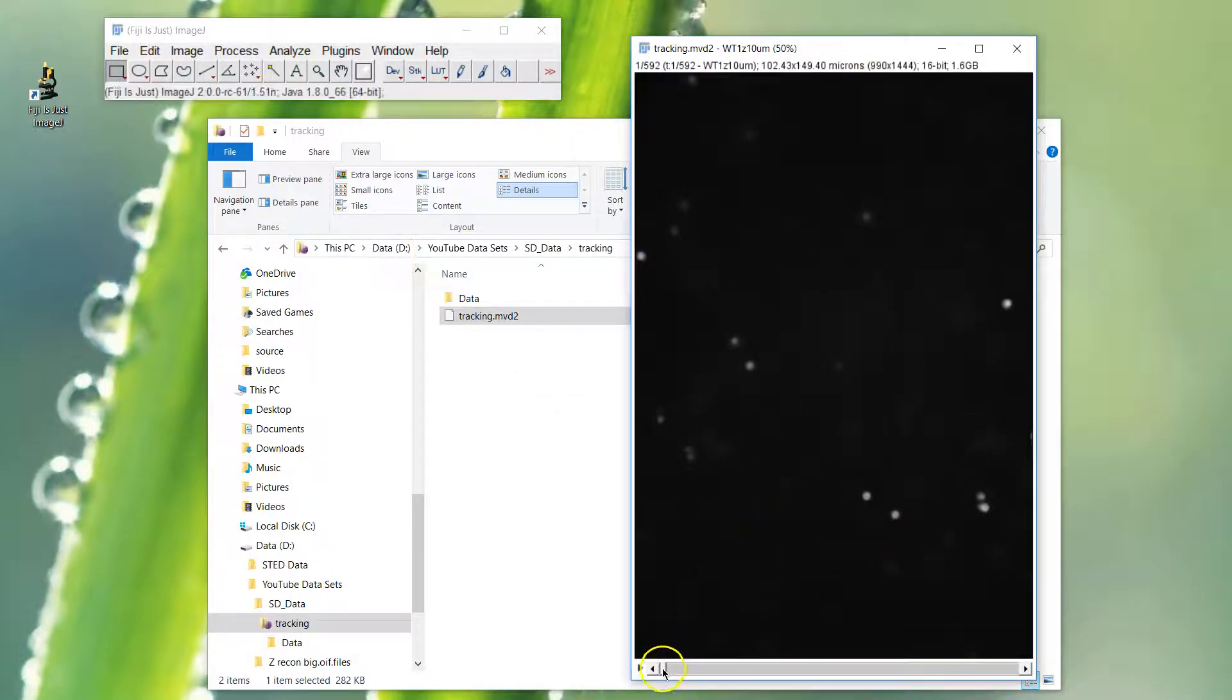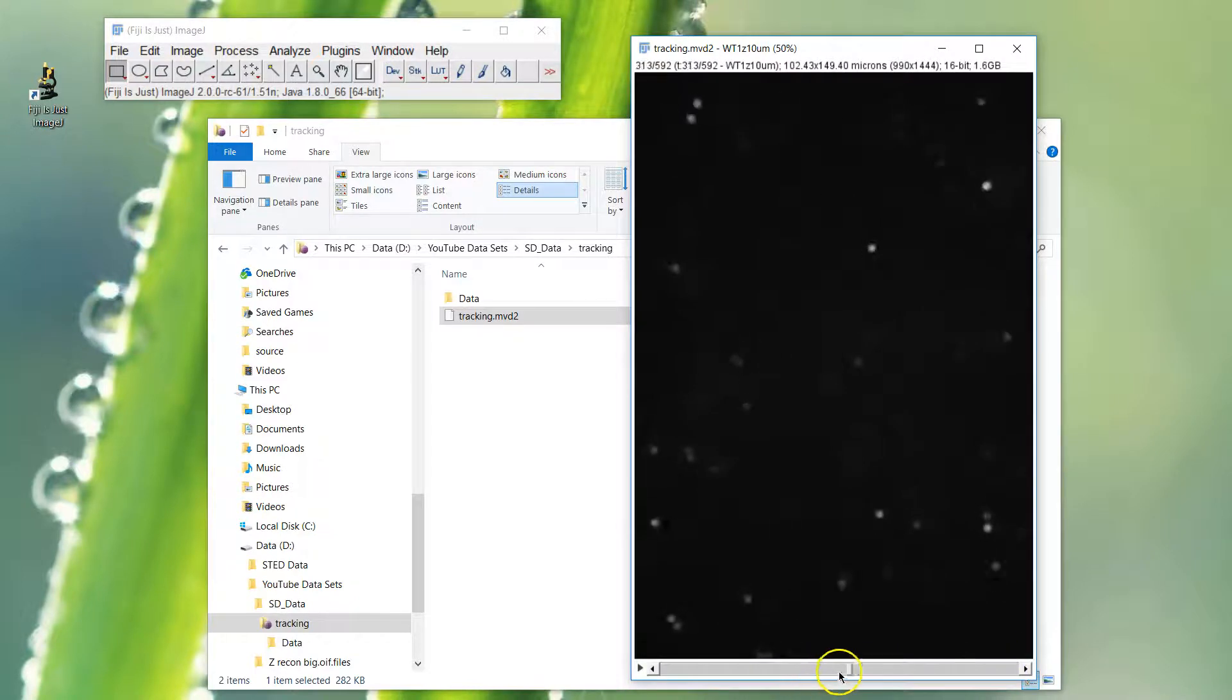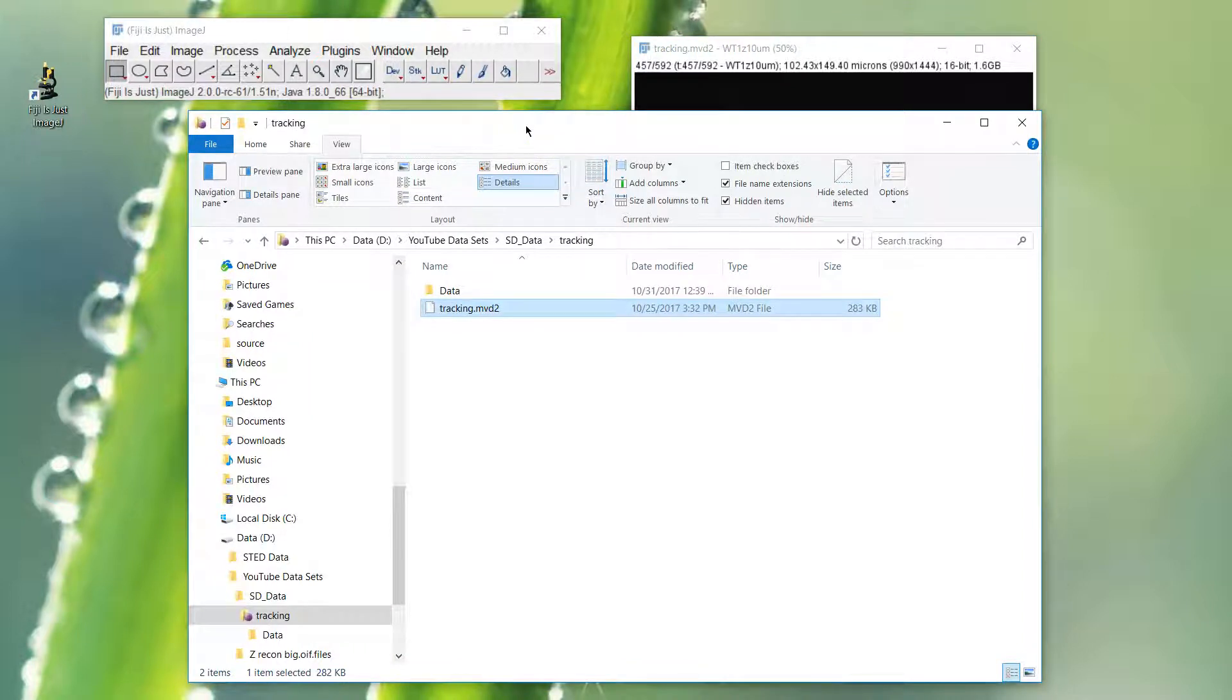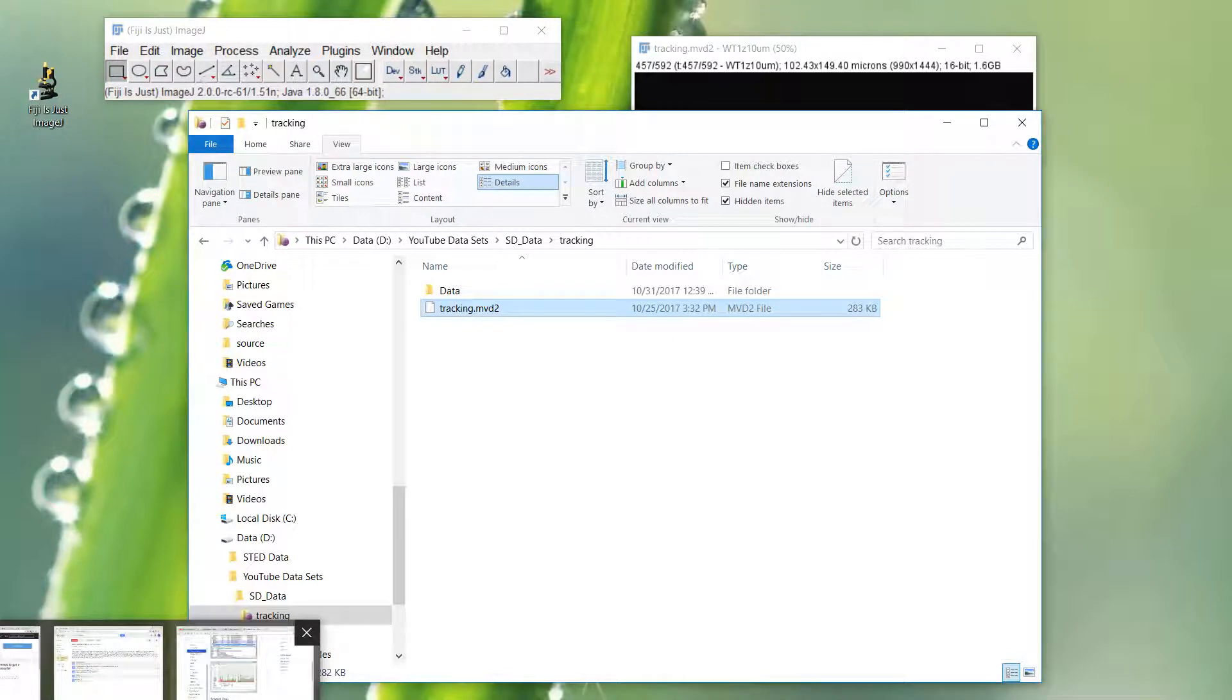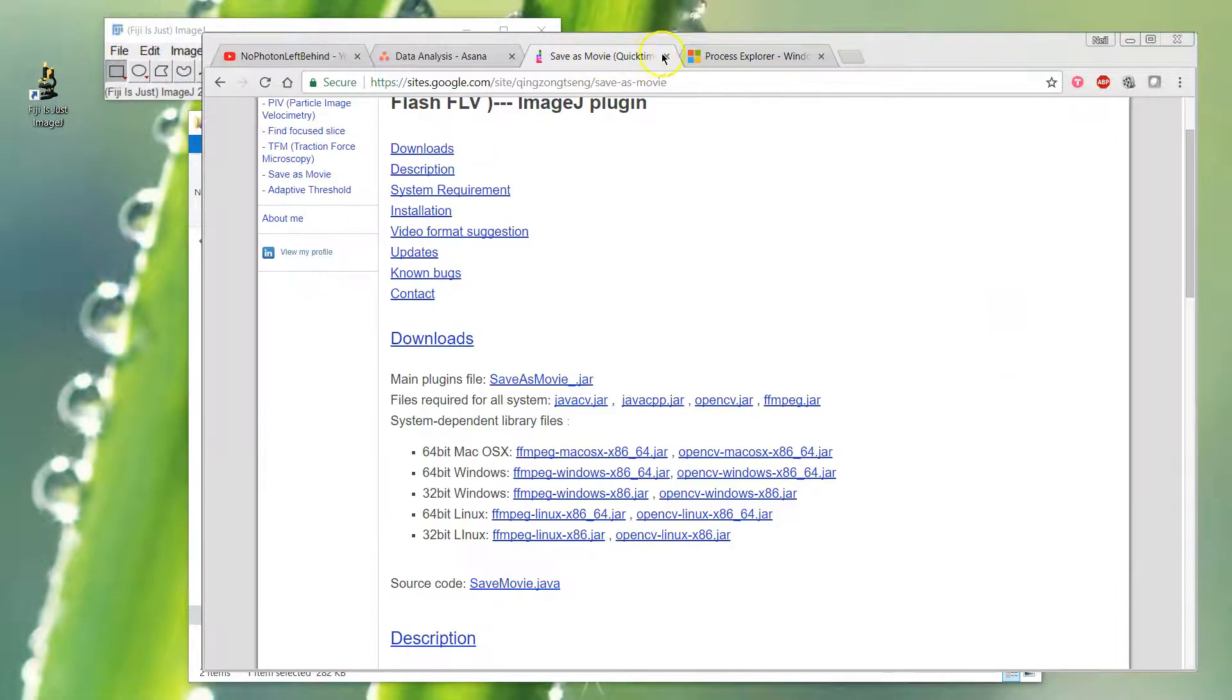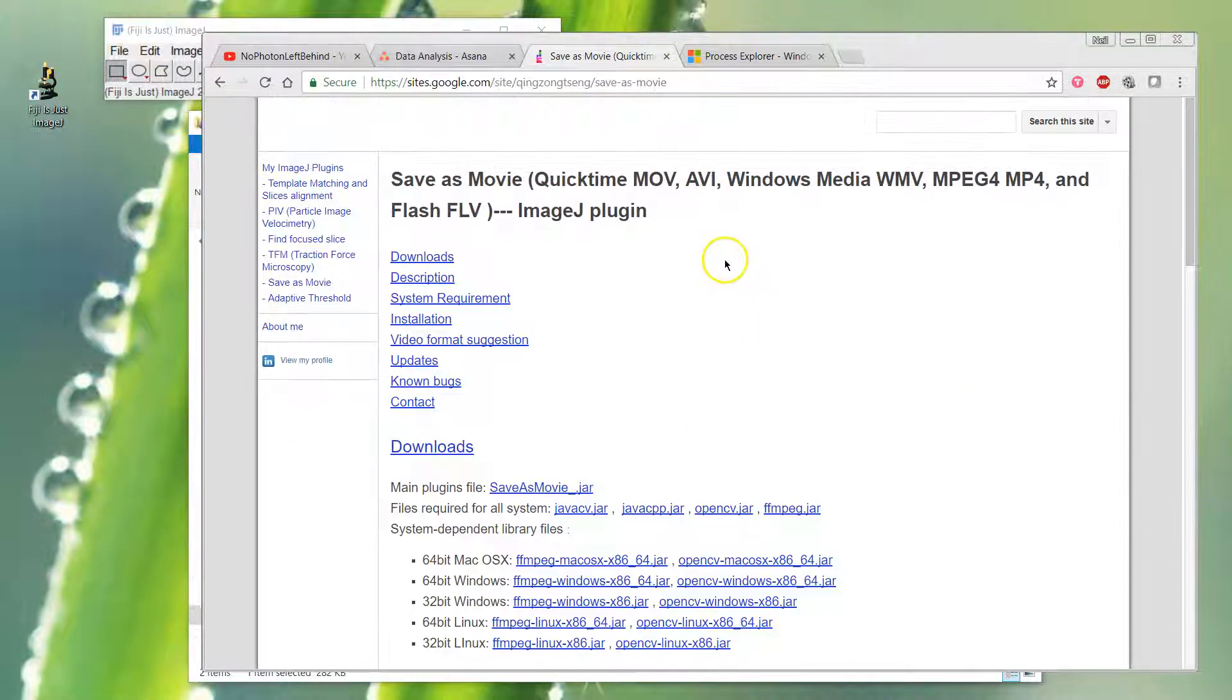Here's the file that's come in. This is a time-lapse taken on the spinning disk. Today we're going to talk about exporting to a movie. There are a couple of options in Fiji, but they've never really worked that well for me.